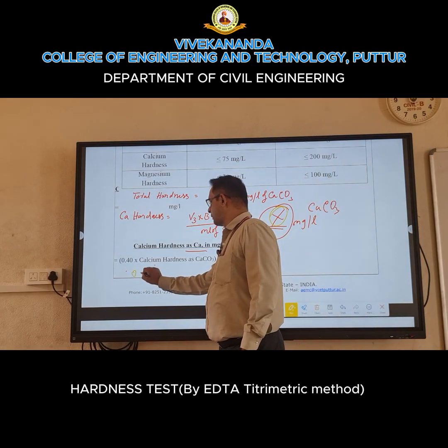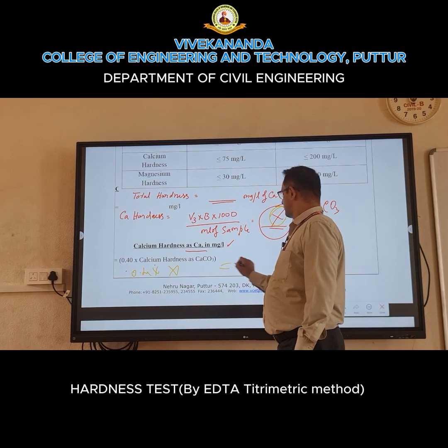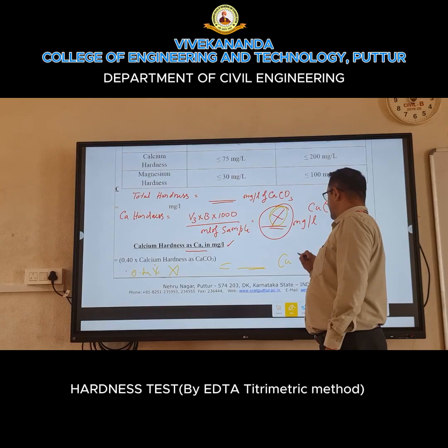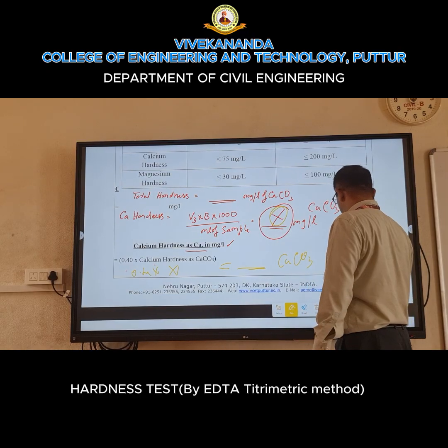So 0.4 into X value, in terms of mg per liter.